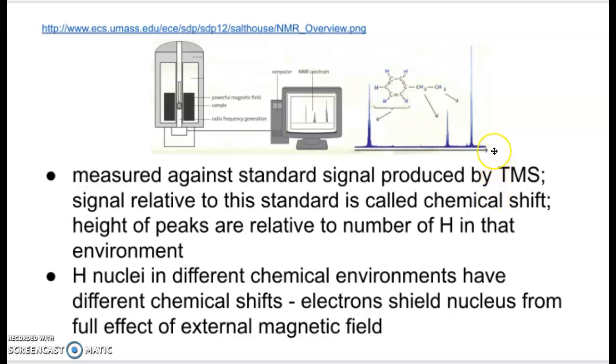The important information that you're going to get from the NMR is the relative number of hydrogens that are in a specific environment. So you know that there's going to be 3 hydrogens that have this environment and 2 hydrogens that have this environment and 5 hydrogens that have this environment. But the actual numbers along the x-axis here are, for our purposes at least, irrelevant. And again, when you study an analytical chemistry class in college, you will probably learn much more about NMR. But for the purposes of what we're doing, those chemical shifts are practically irrelevant information. And so I often tell students to ignore those numbers, because they're not really all that helpful when you're trying to answer questions.